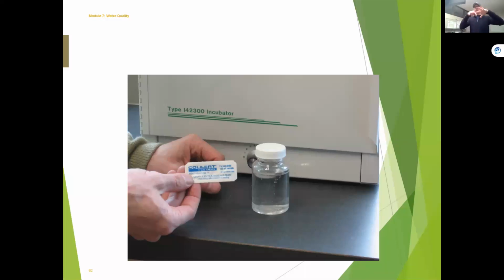It shouldn't be all fizzy. And first of all, if it has an aerator on there, take that aerator off, and make sure that you're able to, because I've seen a lot of aerators. If you ever take an aerator off and look inside it, it could be pretty nasty on the inside of that, right? And you want a more representative sample.